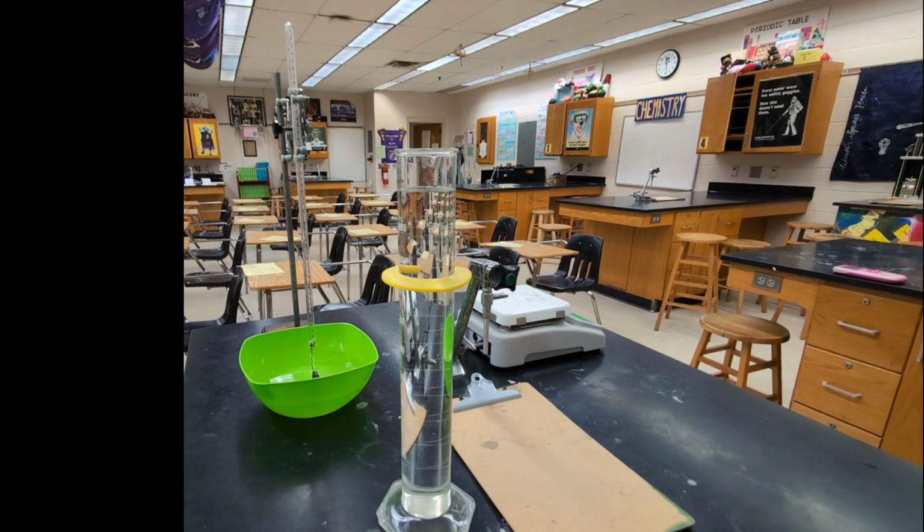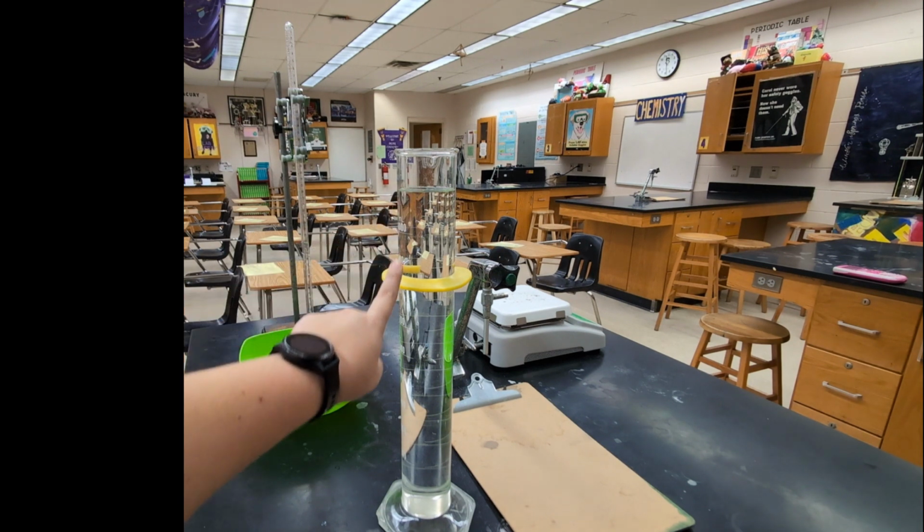All right, now that the bubbles have stopped forming, I'm going to go ahead and take the eudiometer out of the clamp. I'm going to use my thumb to plug up the bottom of the eudiometer to make sure there's no loss of any water, and transfer it over into this really large graduated cylinder.